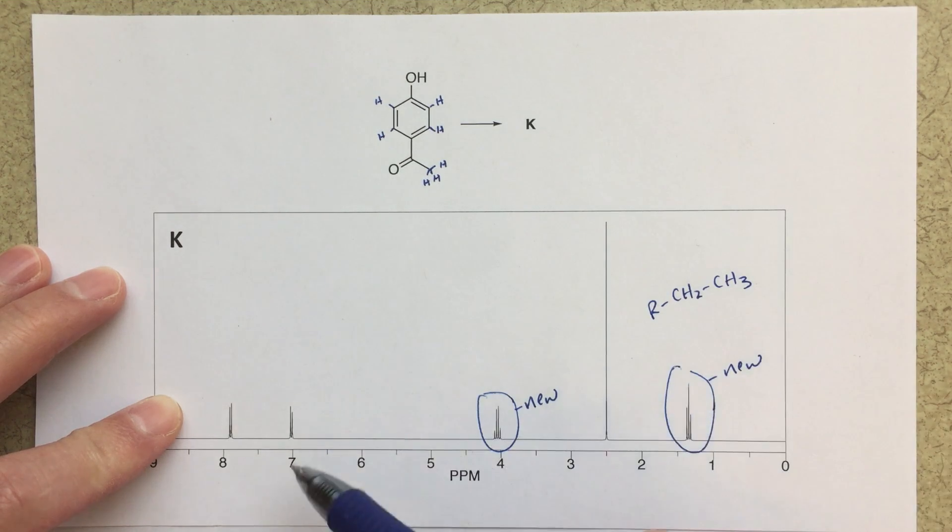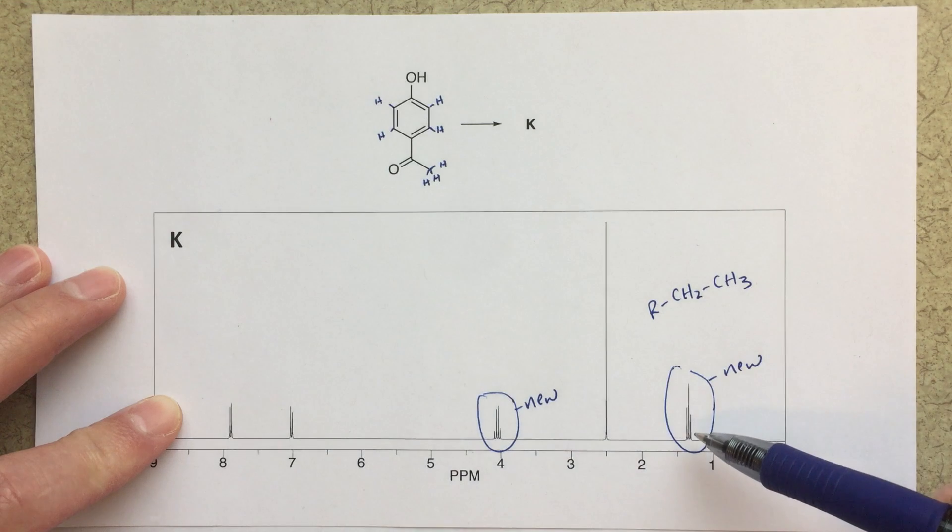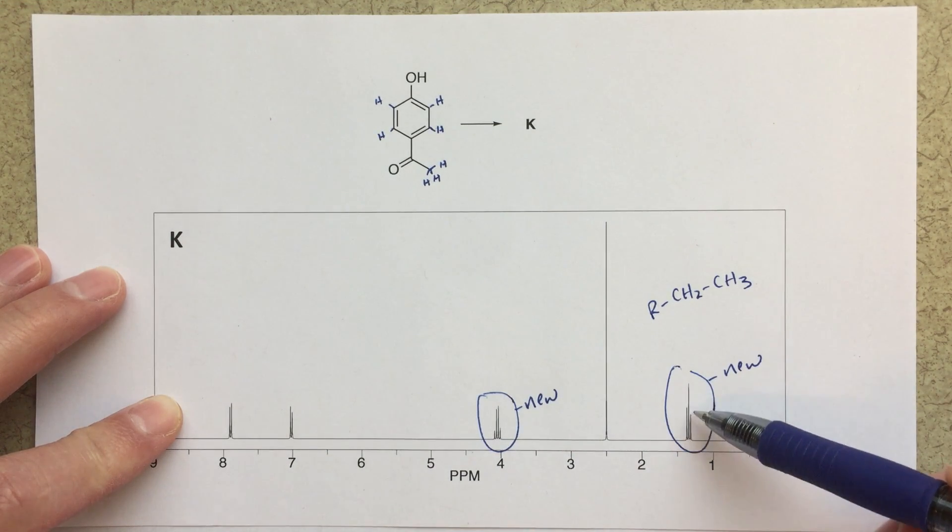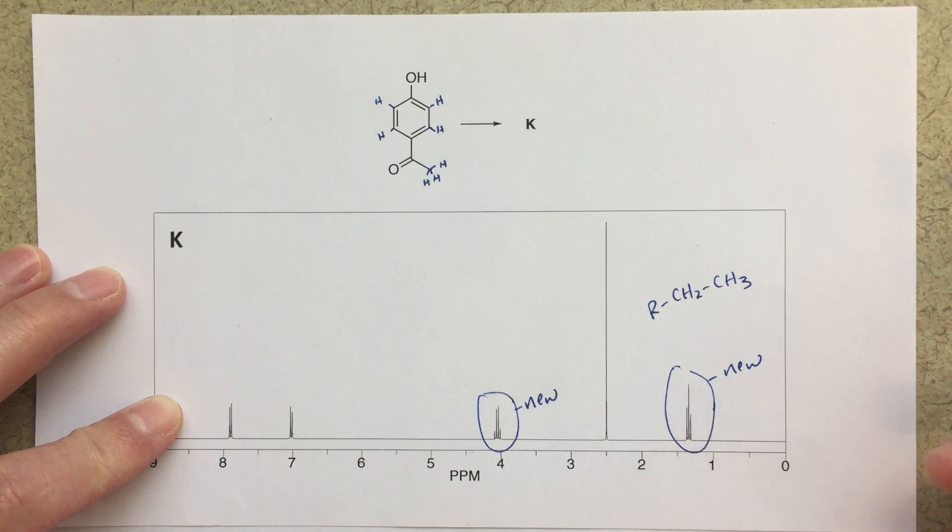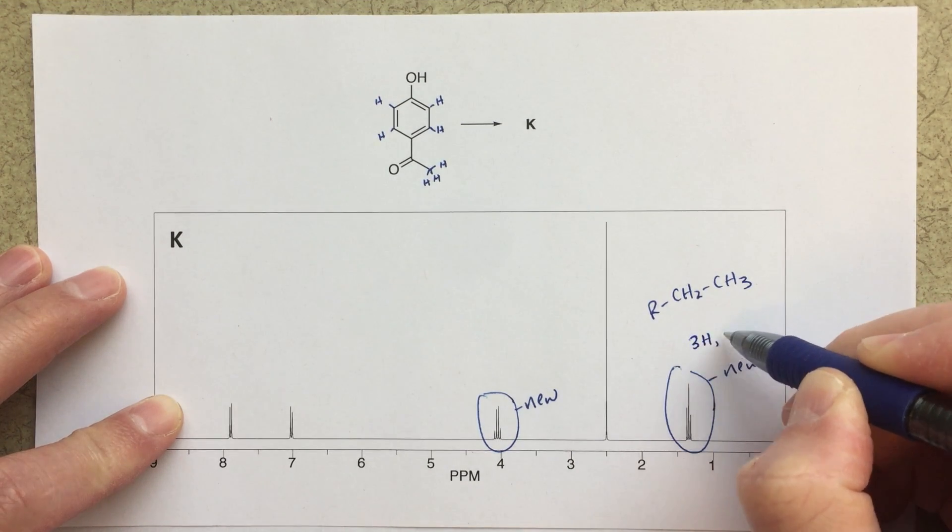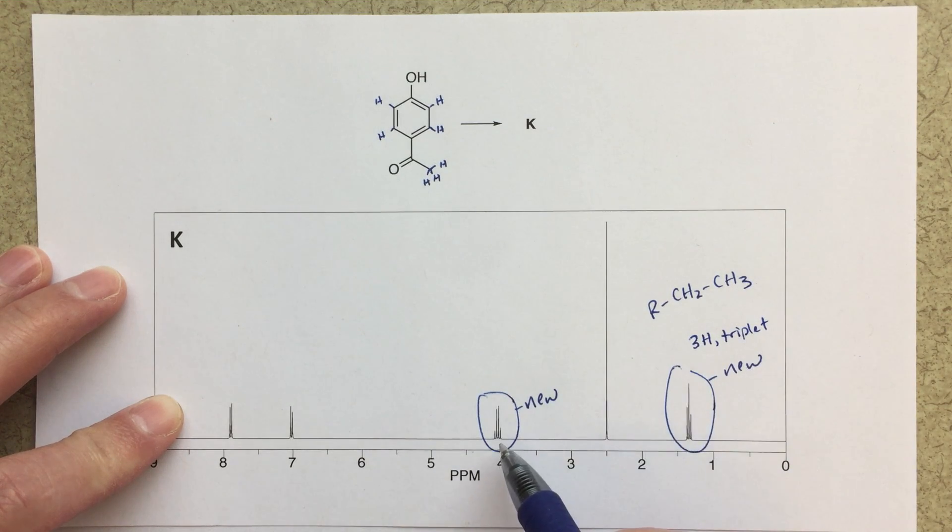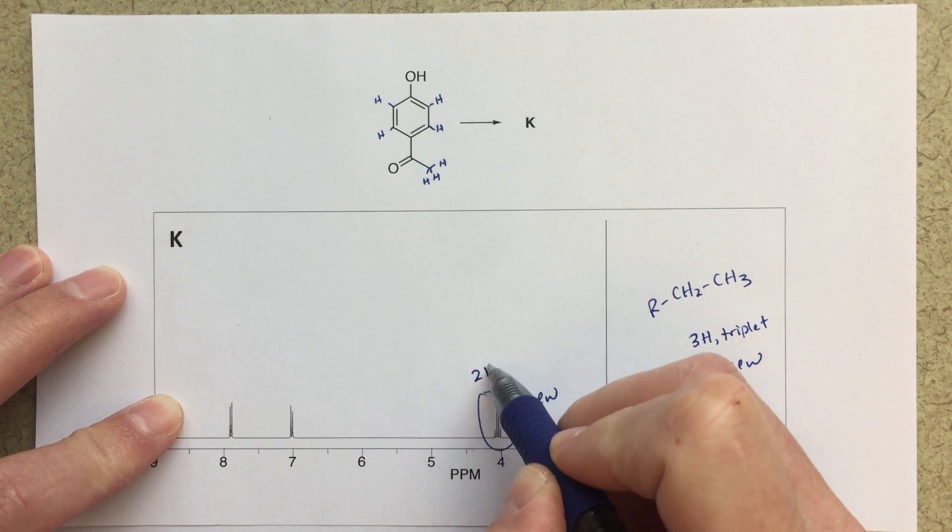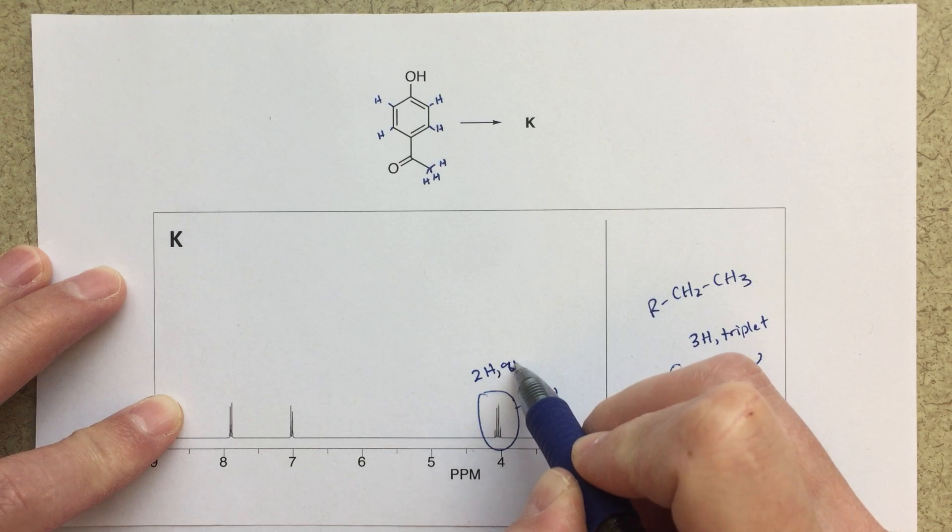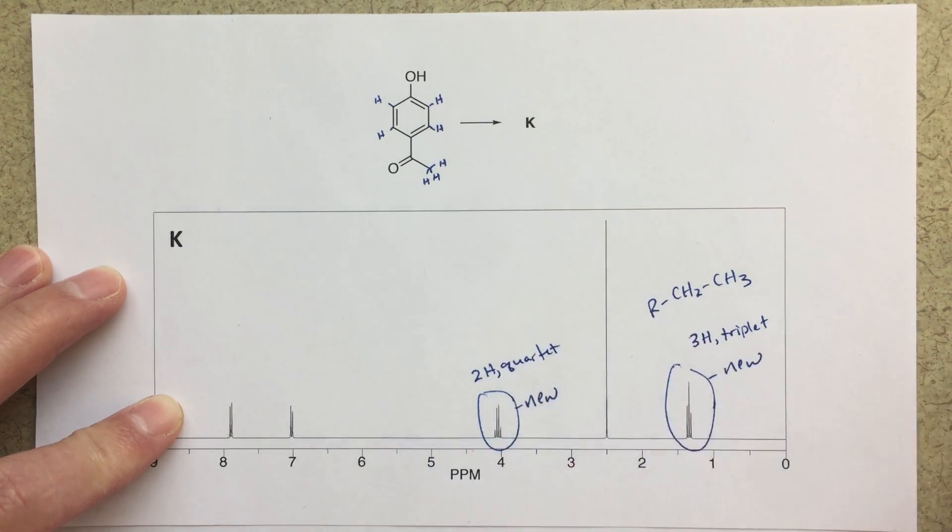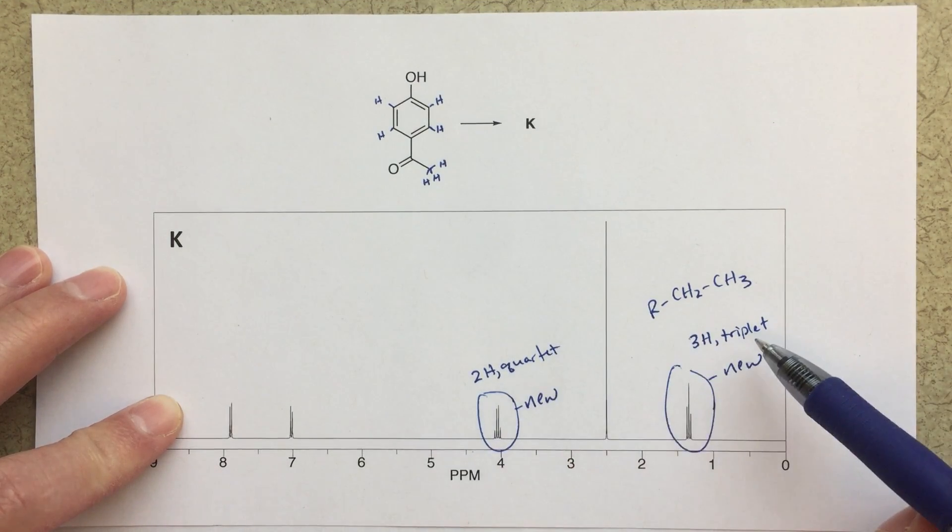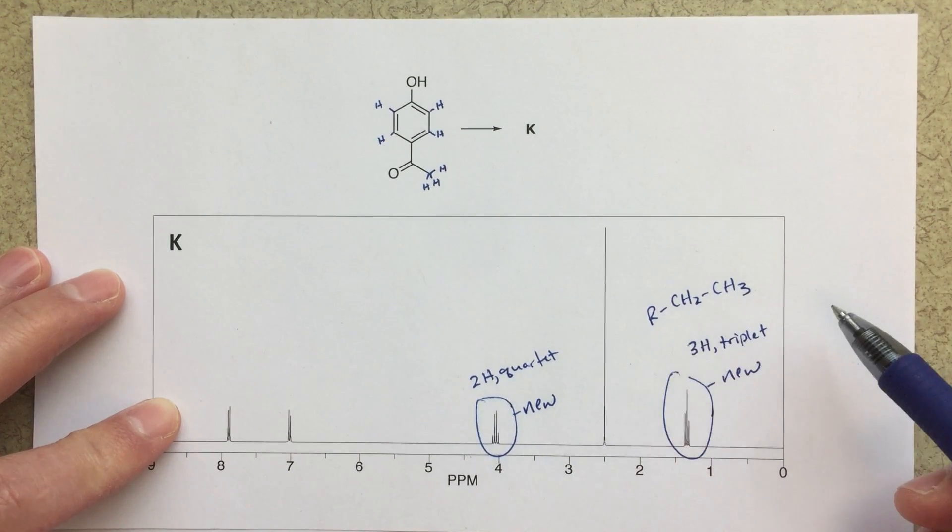It is definitely a little bit higher than my two H peaks here. So it could be a three H triplet, I think that's a pretty good way to label that. We'll just write that in, three H triplet. And then over here I've got something that's a little bit smaller, which suggests a two H quartet. And a two H quartet and a three H triplet is a very common motif for an ethyl group.